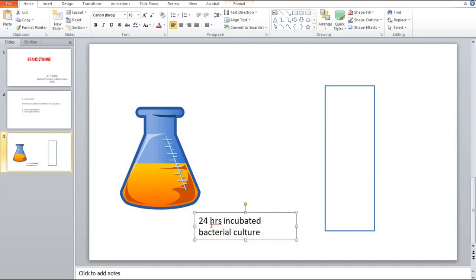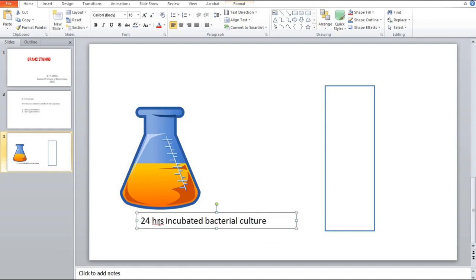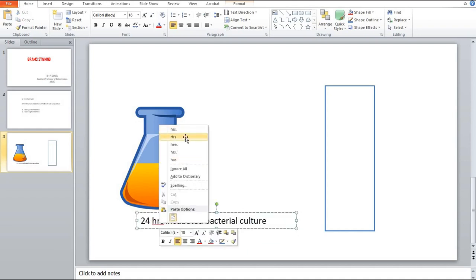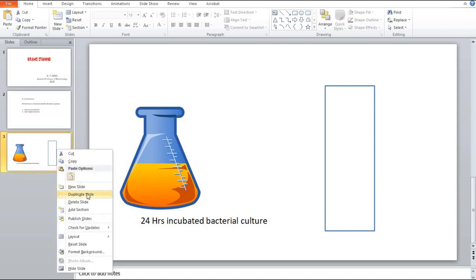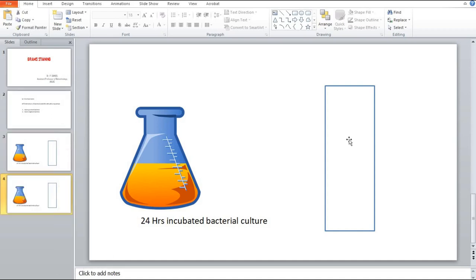We use a 24-hour culture because we should provide enough time for the bacteria to grow and multiply in sufficient numbers. We also need a clean slide.